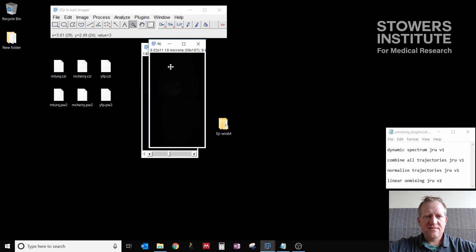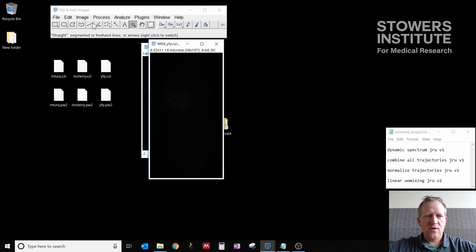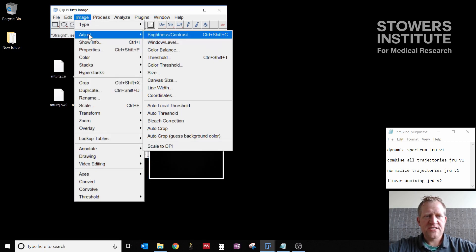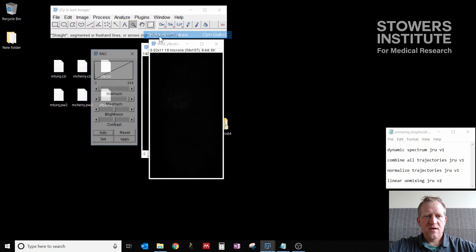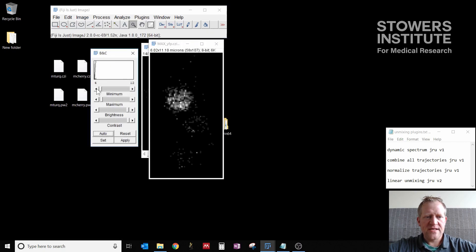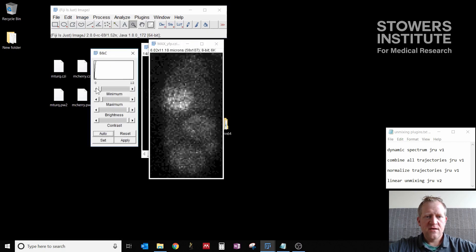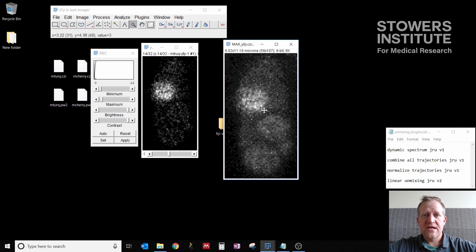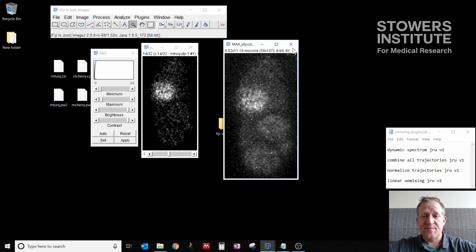This gives me a new window where I can go to image adjust brightness and contrast, and we can see what's going on here. So I have a yeast cell that has some spores in it after it's gone through meiosis. And I want to use this to figure out my YFP spectra.